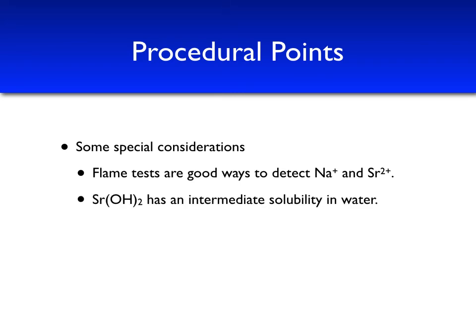Another important point to make is that strontium hydroxide, if you read your solubility rules, appears to be pretty soluble in water. In actuality, at certain concentrations, strontium hydroxide has a very intermediate solubility in water, meaning under certain conditions you might see the presence of strontium hydroxide, and in other conditions you may not.